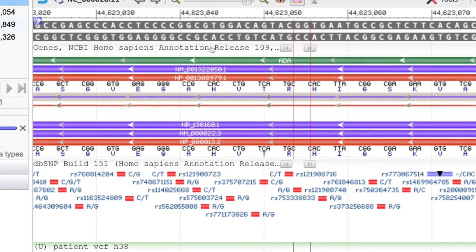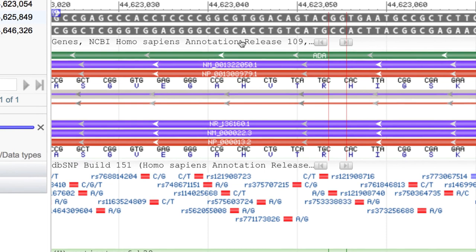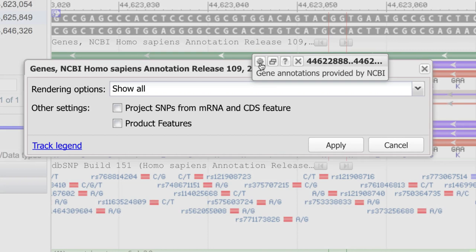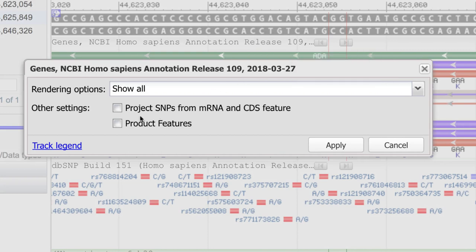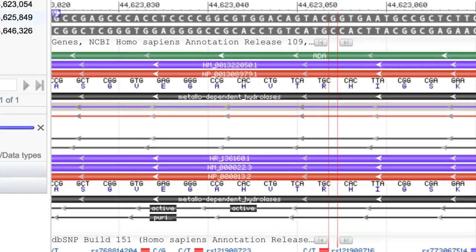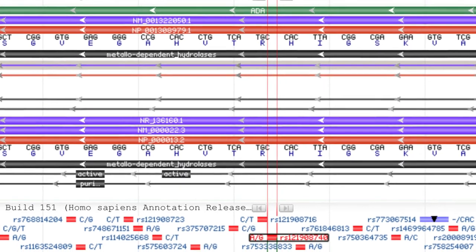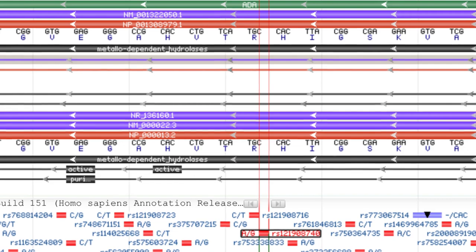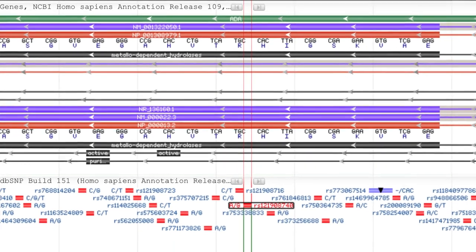We can also add conserved domain information by hovering over the gene track name, clicking on the gear icon, and selecting Product Features. It turns out that this allele is only three amino acids from an active site in this conserved hydrolase domain.